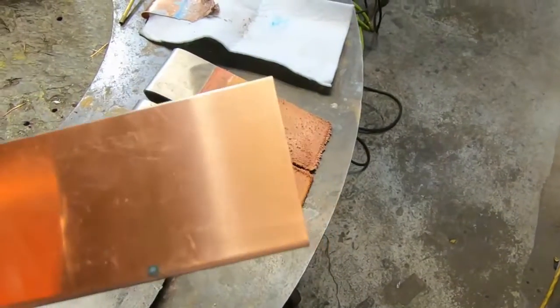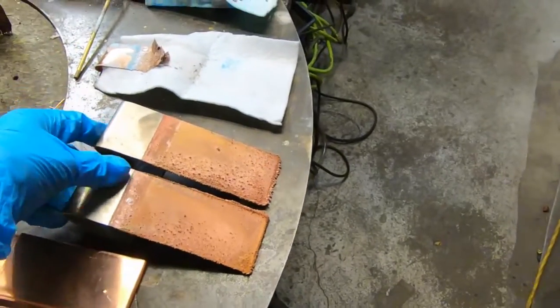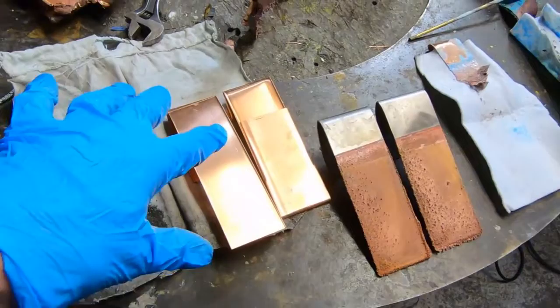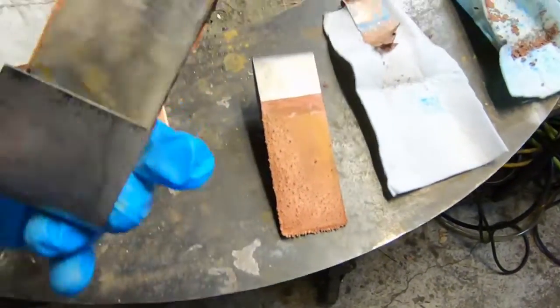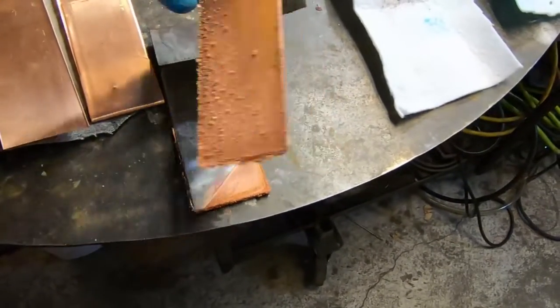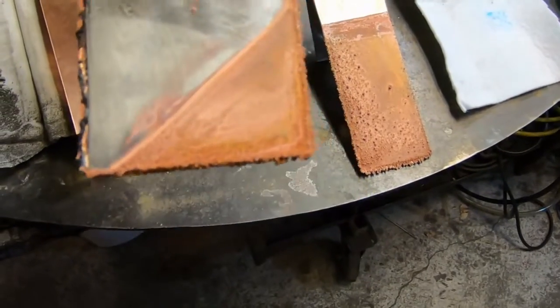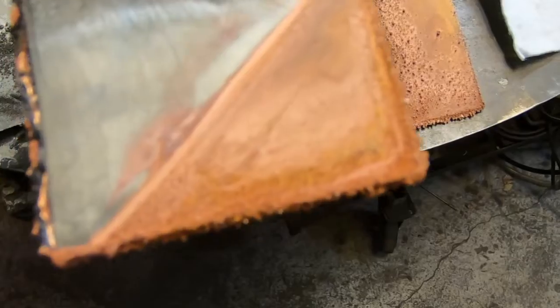I am going to paint the back of these cathodes because I only want the front surface area to be active, because it kind of messes up my surface area calculations doing it the other way. If we allow the back to also react as we did here, it doesn't react as strongly, so all different types of changes take place in the back region there.